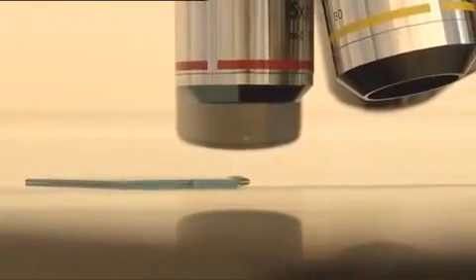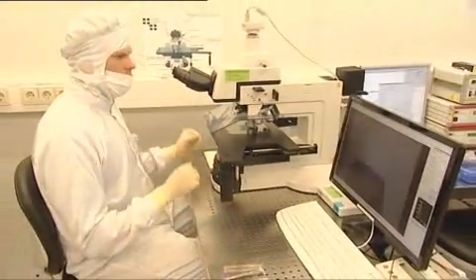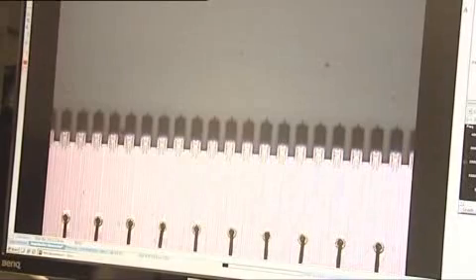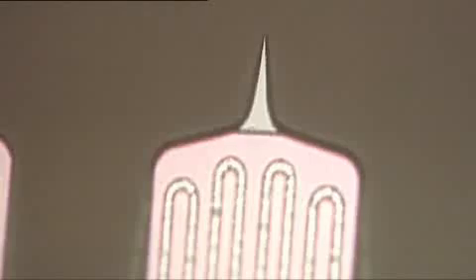It's an array of silicon needles called a cantilever, each of which is only a few microns wide. The Pronano project lets several of these operate simultaneously, whereas the scanners currently on the market are very slow because they use only a single needle. The Pronano technology uses an array of several cantilevers, very fine needles, to examine and scan surfaces.